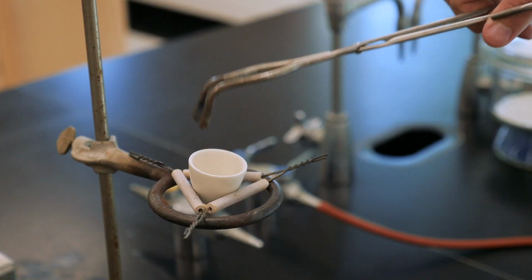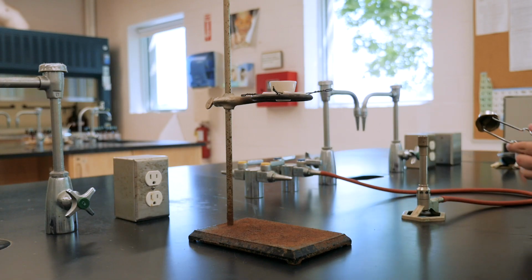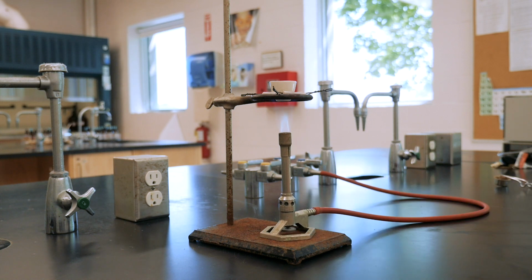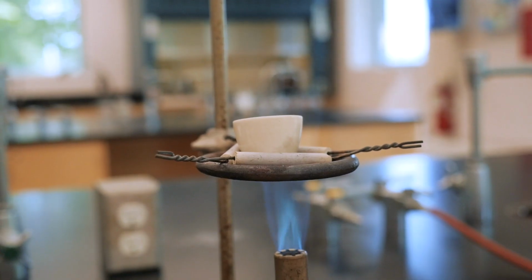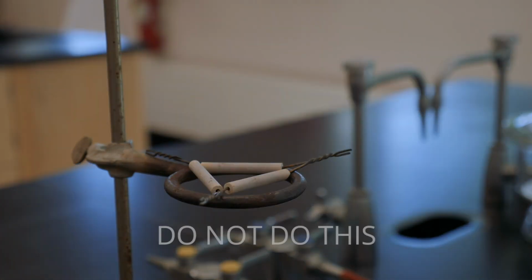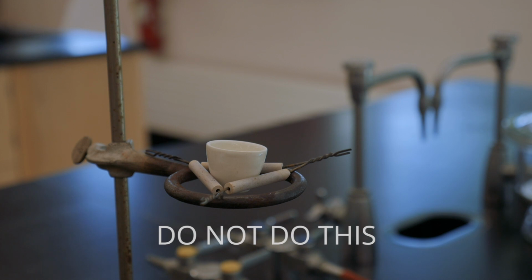Using tongs, place a crucible on a clay triangle and heat it by passing the flame of a Bunsen burner over all its surface, gently at first, and then beneath the crucible with the full flame for about 10 minutes. By doing this, you're trying to remove any atmospheric water molecules that might be adhered to the surface of the crucible itself. We'd like to make a very precise measurement, and so even the crucible has to be perfectly dry. Also, it's important to use tongs whenever you handle the crucible, because even the oils from your hands can affect the mass measured on the very precise balances that we'll be using.